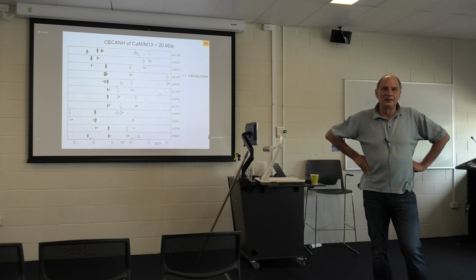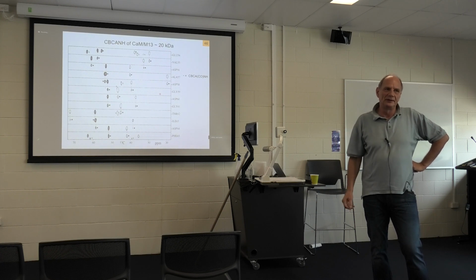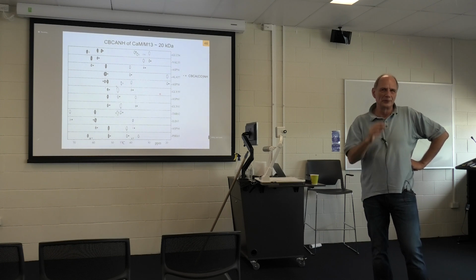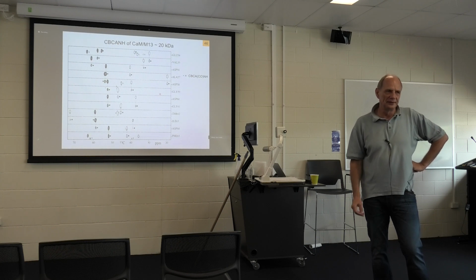I was astonished, when we were recently assigning a protein again, that this type of calculation is not incorporated in CCPN or somewhere now, and this is so simple. I rewrote the code in Python, so if anybody's interested, it's just putting in these C-alpha C-beta numbers, but you could probably get quite a bit better by using the individual amino acid type probabilities.